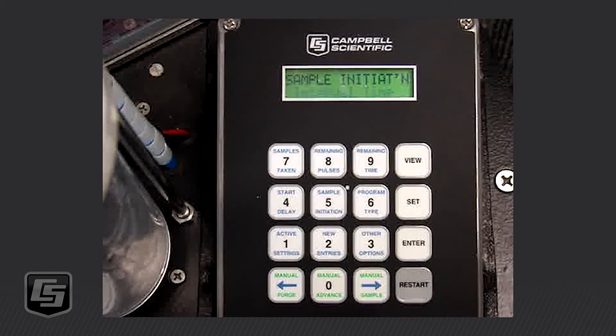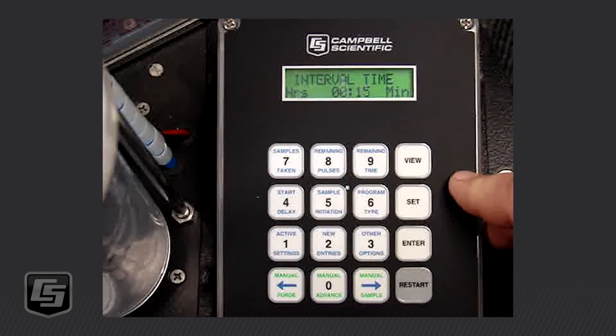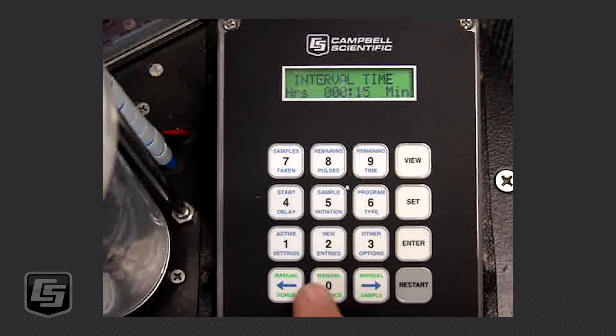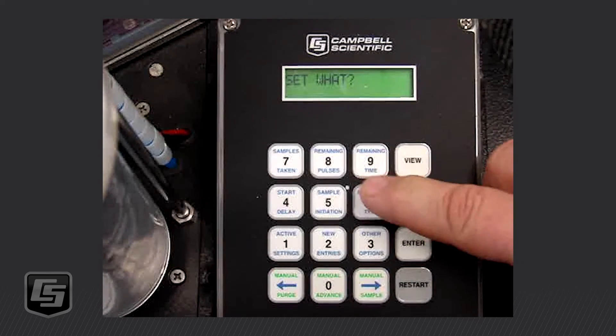Now I want to set my interval time, so we're going to do SET, number five — Sample Initiation. The interval time comes up first. You can also do pulse input, external contact, or disable it — but we're going to do Interval Time, so we press Enter. I said I was going to program this for a 15-minute interval. If you wanted every one hour, you'd enter a one and two zeros. I'm going to leave it at 15 minutes and press Enter.